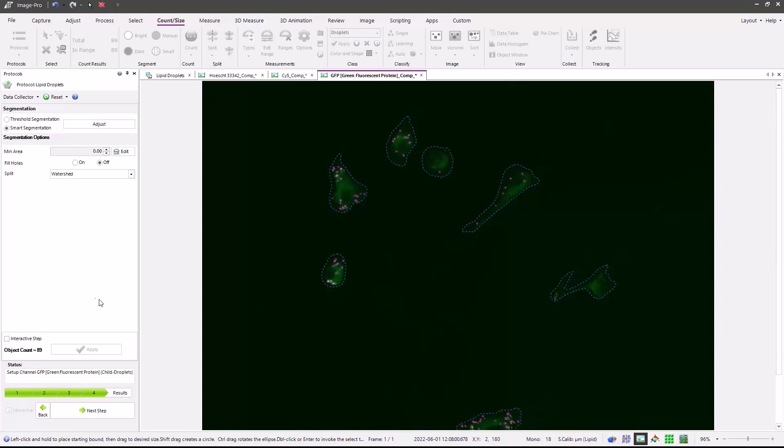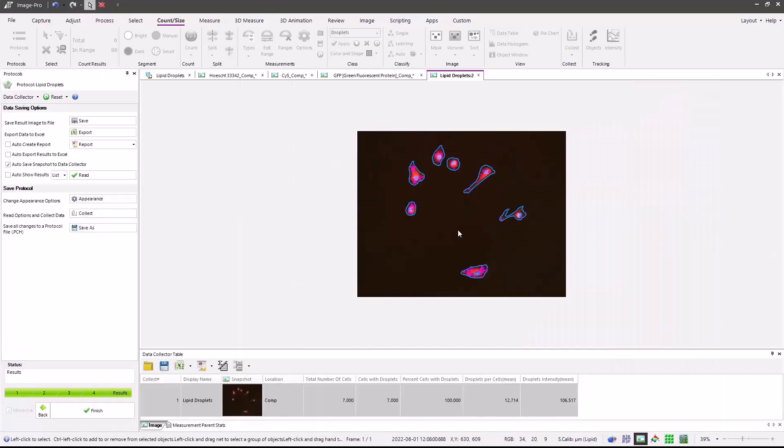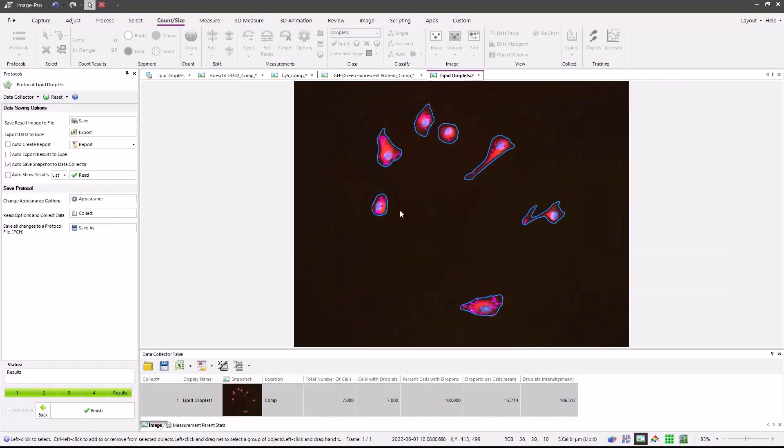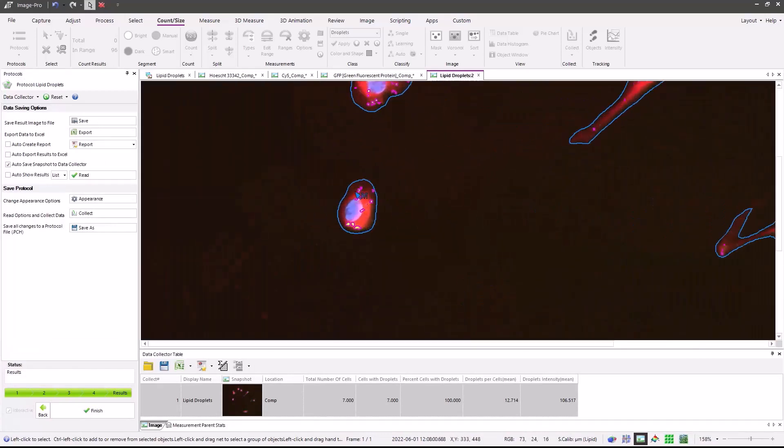Pressing the next step button, the data is now all collected. Now that the analysis has been complete, you can look at the snapshot image and review how well the cells have been found, but more importantly, the lipid droplets within that cell.